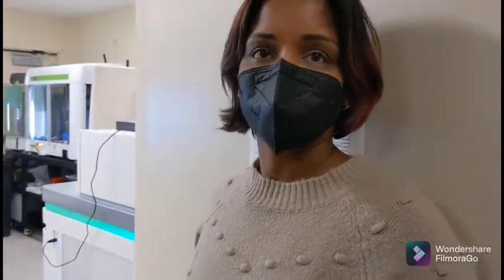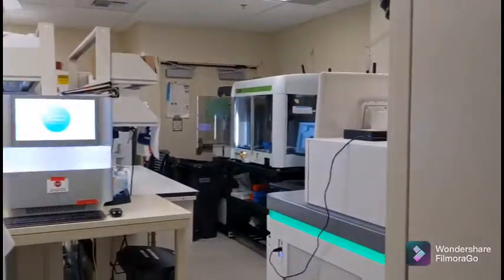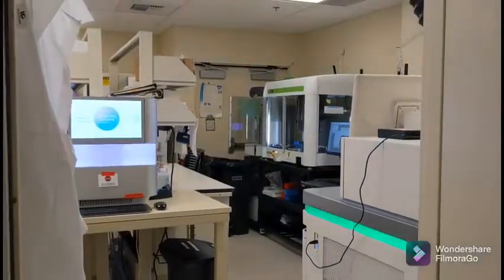Excellent. So once you get a sample in here, even with the robotics involved, how long does it take to get results? Because we do this in a batched manner, and because there are so many steps involved in the process, it can take up to 7 days to go from sample to sequencing result. But having said that, if there was a particular sample that we needed to do really quickly, we have the ability to do it in under 24 hours or about 24 hours. That's pretty amazing. Like we did with the initial pieces of the Omicron variant.